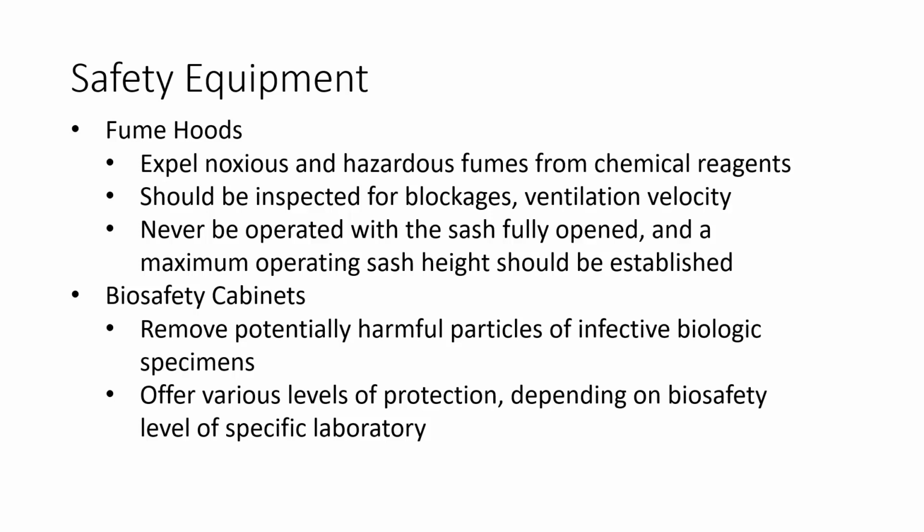So a fume hood is different from a biosafety cabinet in that a fume hood typically takes the fumes that are released from chemical reactions and dissipates them outside of the building. So it'll go through some filter systems and then it will expel the fumes out into the environment. When those fumes leave into the environment, they're diffused enough so that it's at a safe level. So if there was an animal or a person standing outside where it did vent out, it would be immediately diffused out and it would be at a safe level.